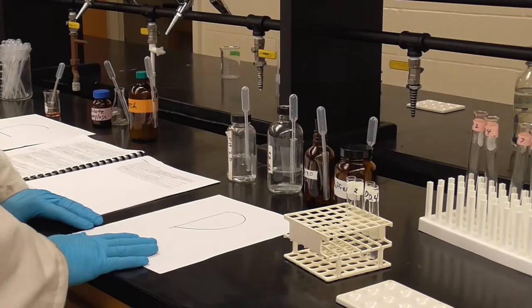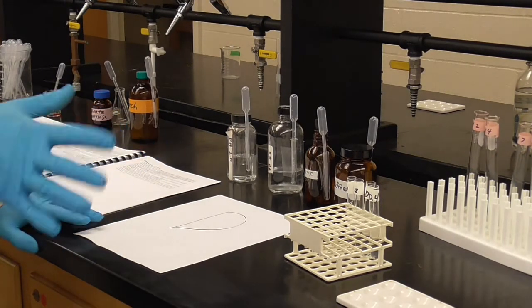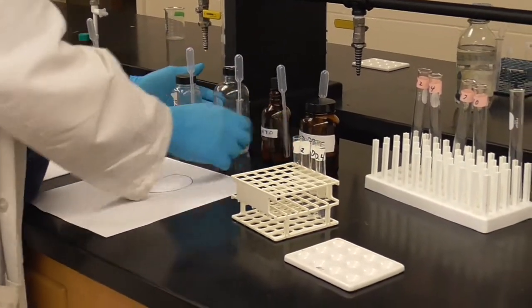Part D. Here we're investigating pH. Remember, 7 is neutral pH, body pH is about 7.4. Less than 7 are acids, greater than 7 are bases. And so, how do enzymes like amylase respond to pH?